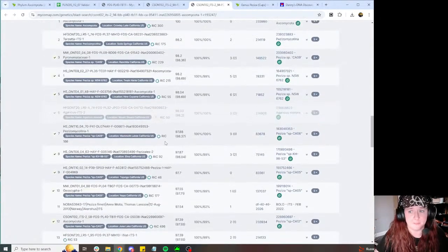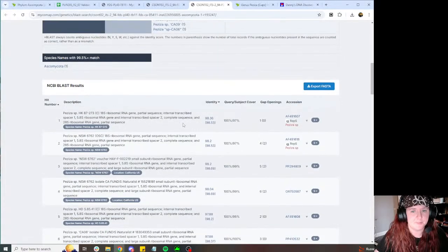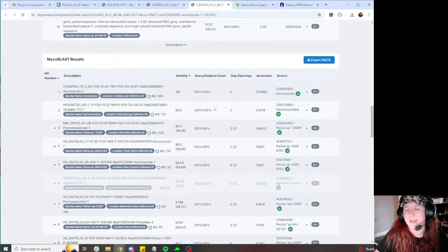So I'm actually probably going to put a temp code on this one because there's not really any matches above 99%.